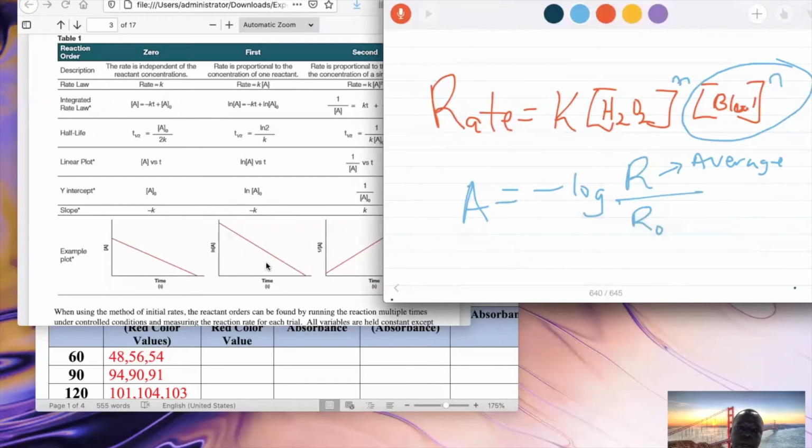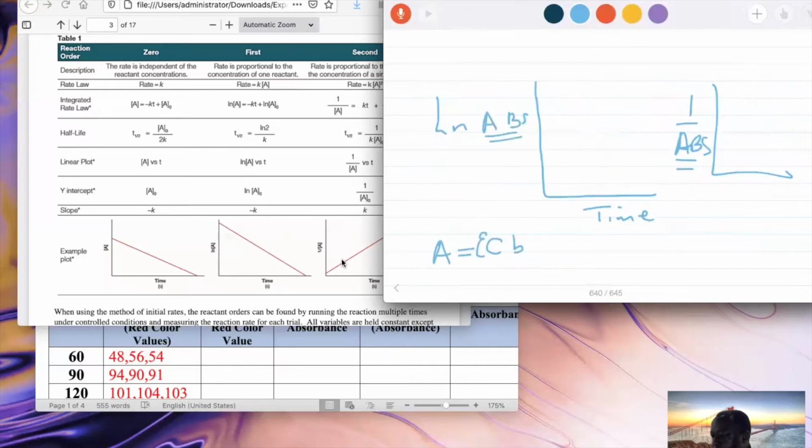You may notice the results might not be exactly the same, so I'll go with the R squared value of the trend line, where the closer to one, the better the fit.